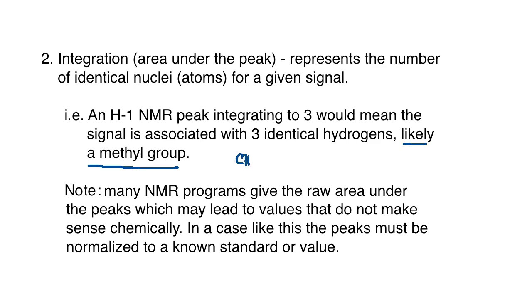you have a tert-butyl group where you have CH3, CH3, CH3? Well, these are CH3s, right? However, these are all chemically identical to one another when we're looking at them. And so magnetically, when we look at their spin, they're going to all appear in the same singlet area on the NMR, and therefore they will integrate to 9 when we see that.